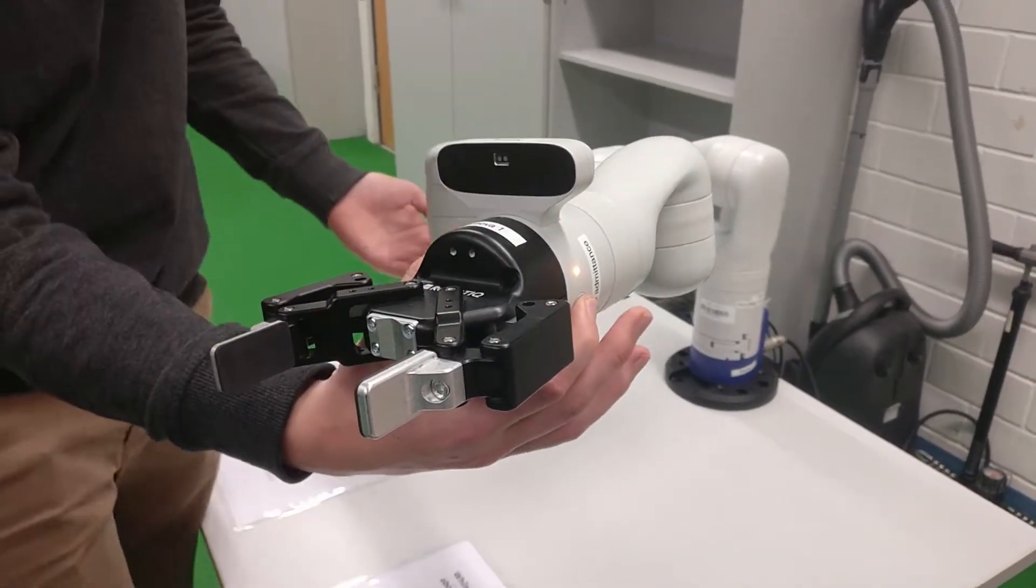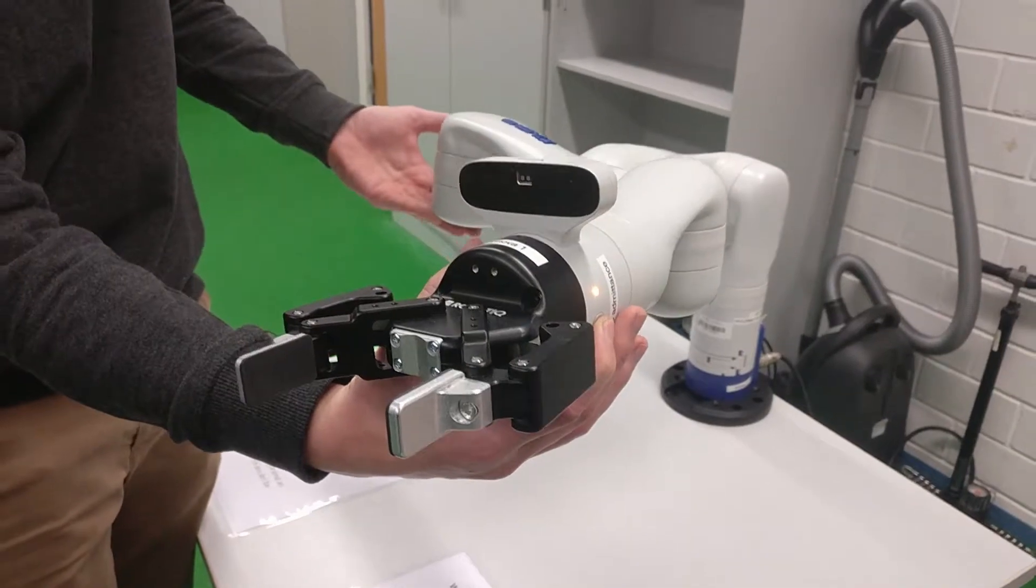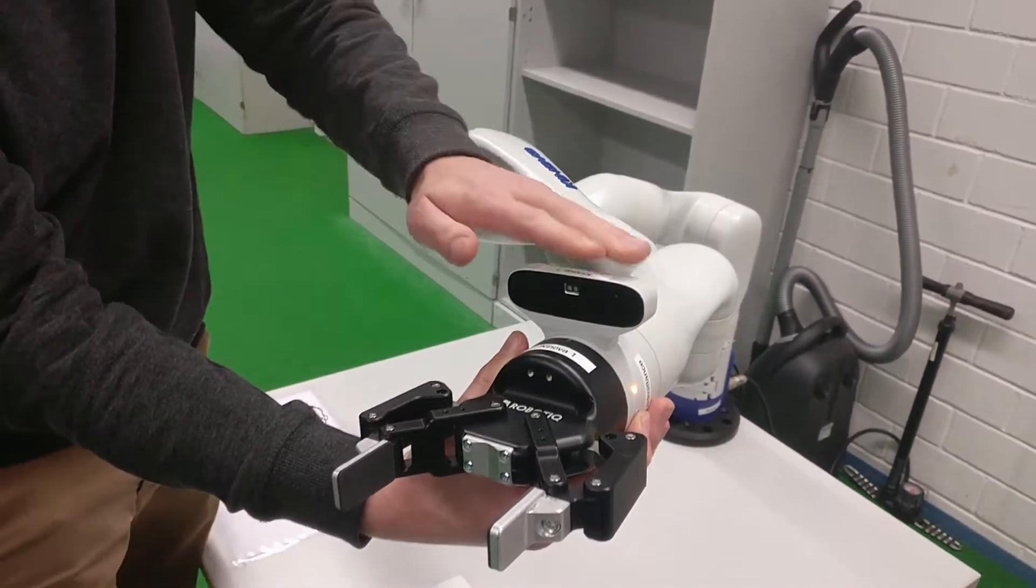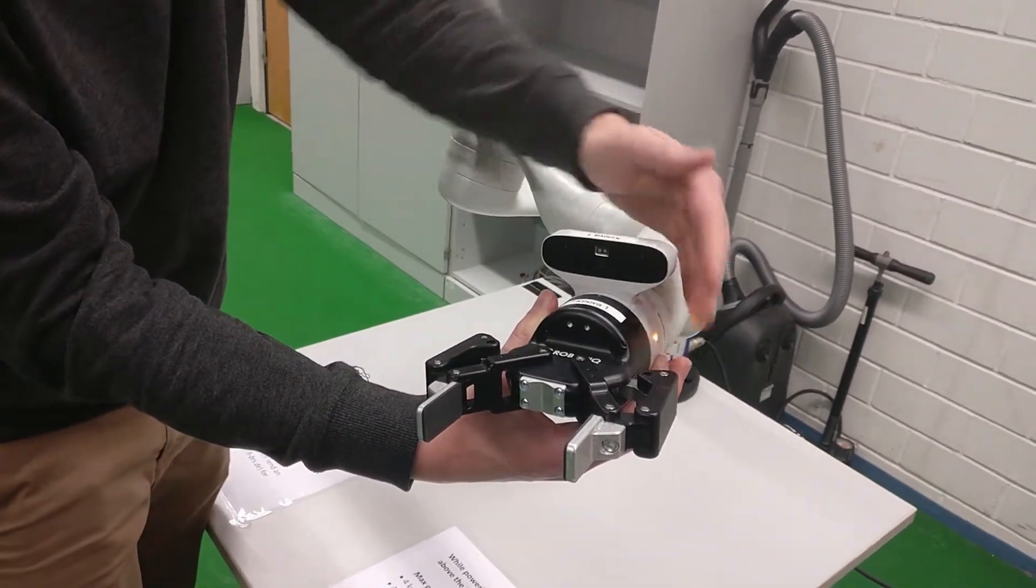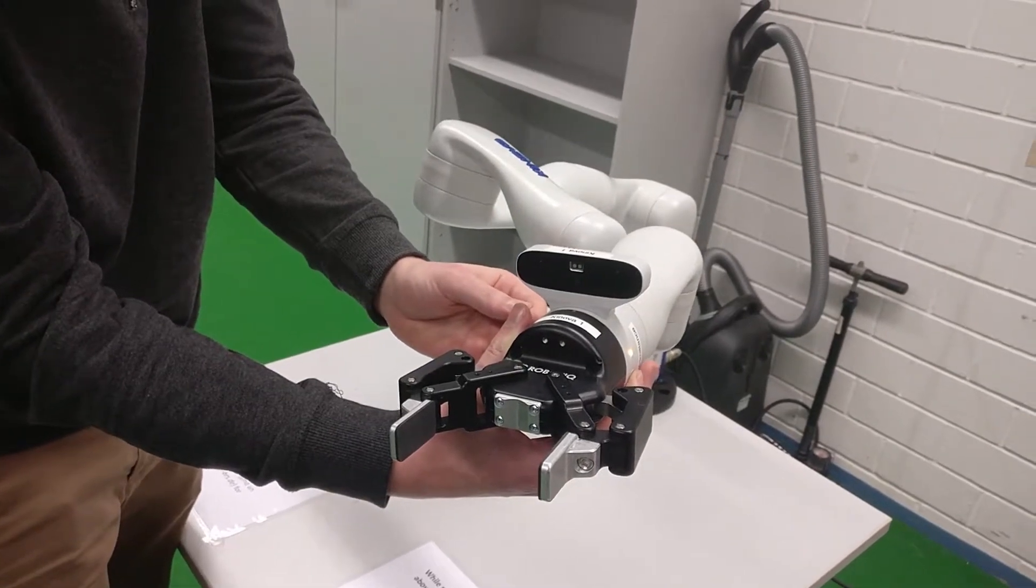So if I press this, I can now rotate the arm. But if any force is applied to the end effector, the controller compensates.